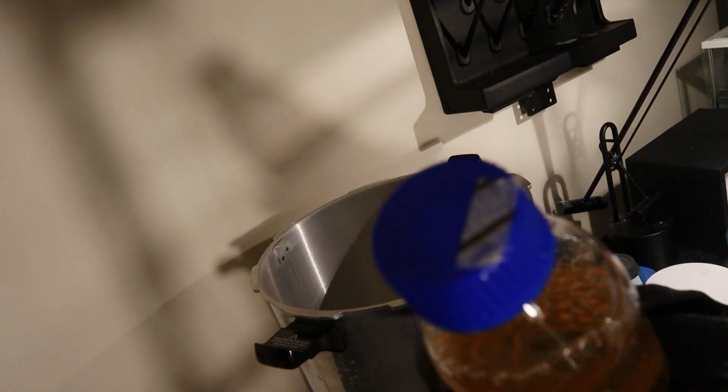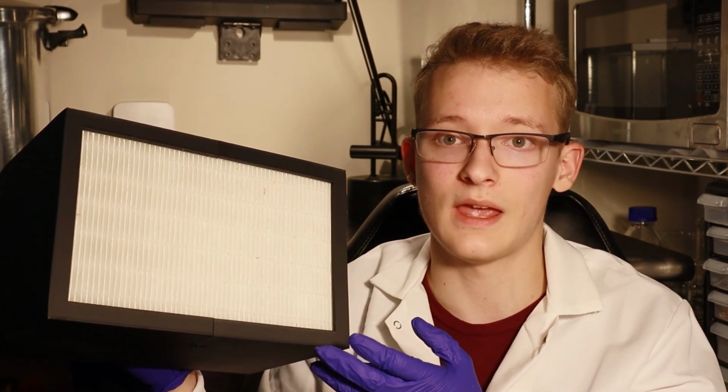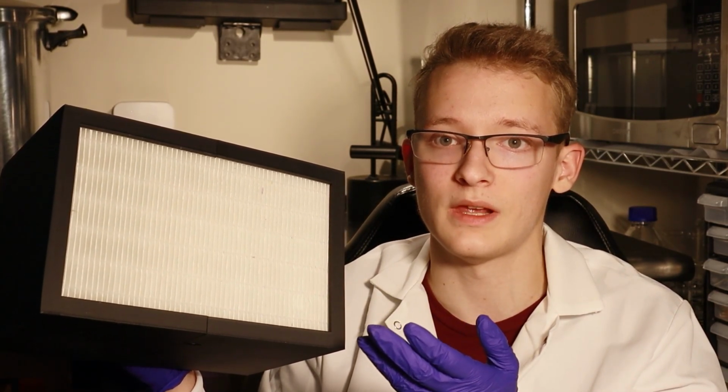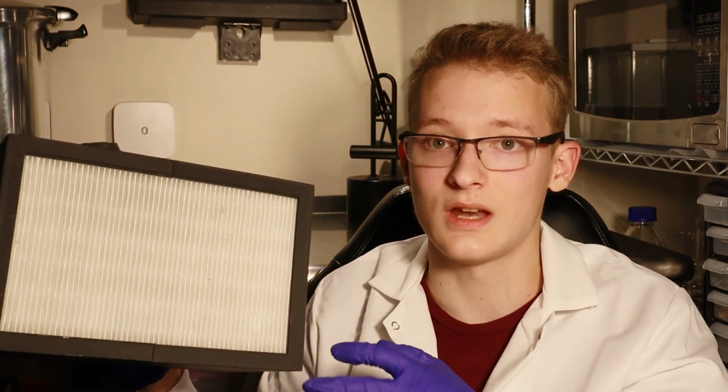Notice how the autoclave tape is black. This means that the pressure cooker successfully reached 121 degrees Celsius, which means my bottle is probably sterile now. Now, to ensure it stays that way when pouring it, I have something called a laminar flow hood. This is basically a fan behind a very nice filter. This filter is fine enough to trap any microbes and spores from the air inside of it. This allows the air coming out in front of it to be sterile and an area wide enough for me to pour in. I turned it sideways to accommodate my bottle and laid out stacks of petri dishes.